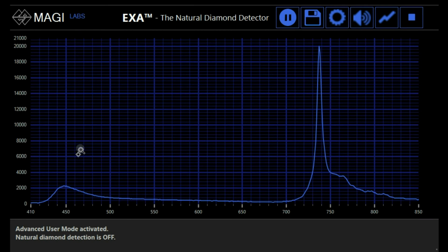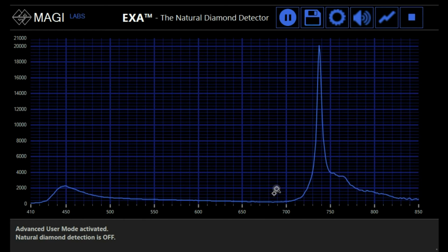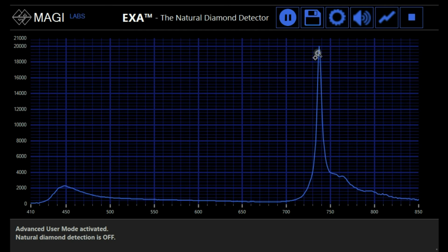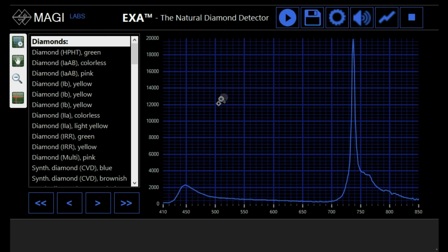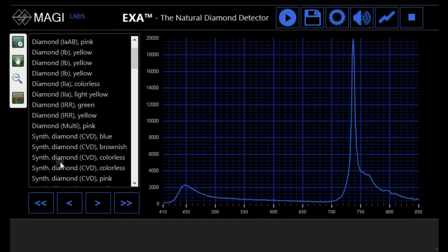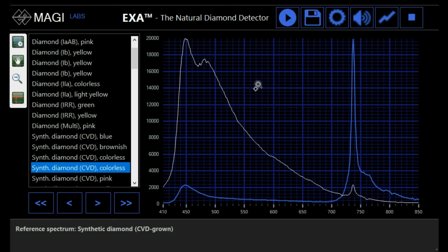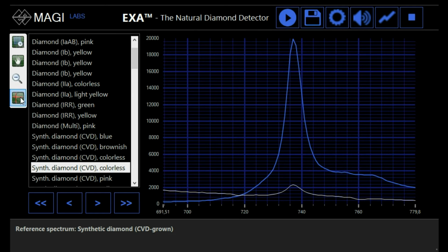This spectrum is missing the N3 peak and its sidebands completely. Something to notice is this peak dominating the infrared area. We can pause the scan and the database will show up. It will not take much to recognize a spectrum featuring the same peak. To be more sure about the matching location, we can zoom the section and activate the cursor.